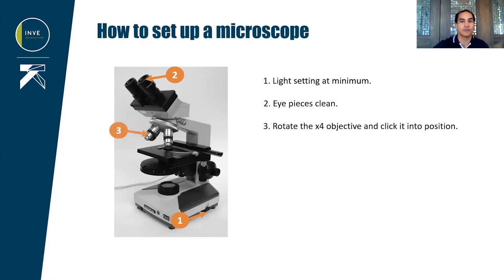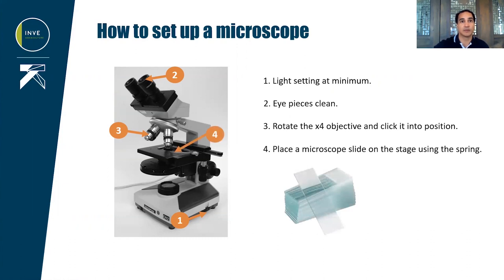Carefully rotate the full objective and click it in position. Then you can place your microscope slide on the stage and secure the position of the spring. Adjust the specimen so that you focus on a certain part of the slide.